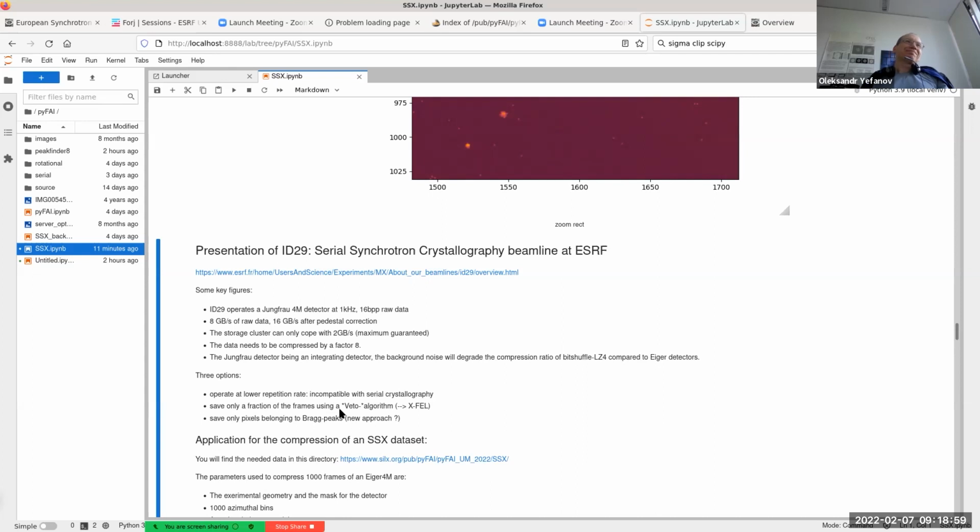You're right. So basically this is where Nicola comes into the game, because he said that he'd prefer to have something that looks like a veto algorithm, but we'll let him present his ideas very soon.